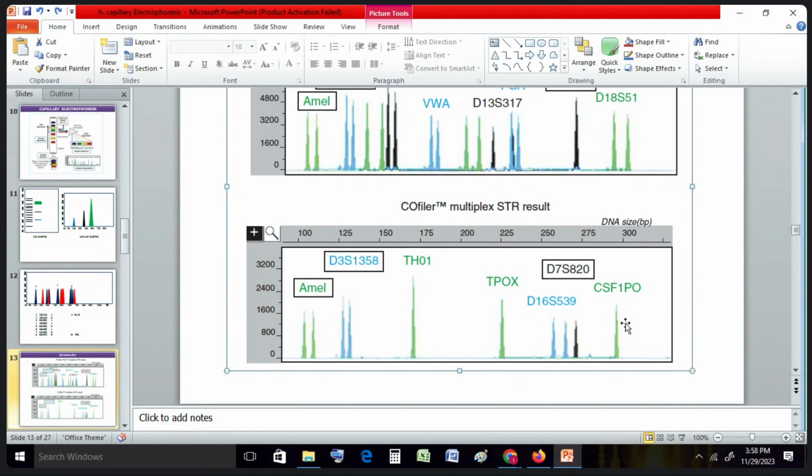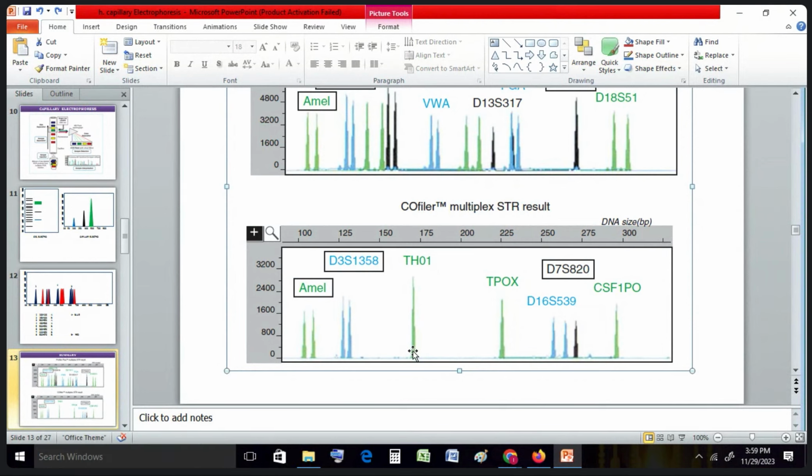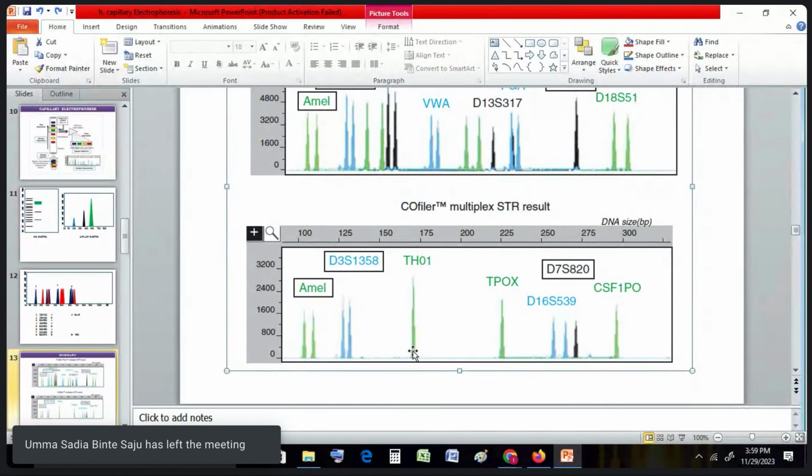Now, just for your curiosity, I am giving you another example. For this position, TH01, you do the PCR of a sample and you get 3 peaks. What does it mean? 3টা peak পেলাম, মানে 3 রকমের repeat আছে. 3 peaks means 3 different sizes of repeat carried in that sample. What will you understand from this? Whether the sample is good or the sample is contaminated.